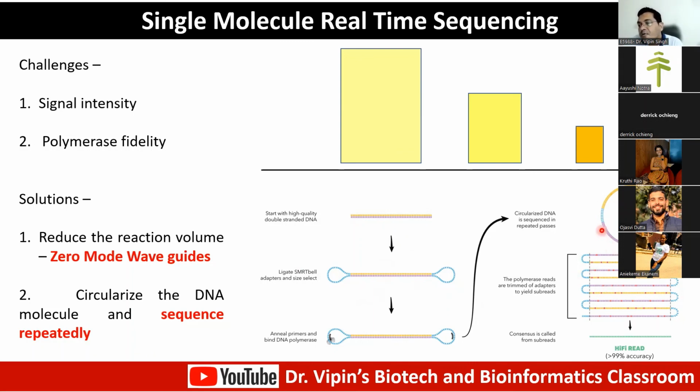What happens is you will have the entire sequence, and in between you'll have your adapters. So this is kind of a concatemer that you get, and you align it together. For each position, you look at the most frequent nucleotide that is there, and that is what is known as a hi-fi read. You generate a consensus sequence depending on the nucleotide most commonly occurring. That gives you greater than 99% accuracy.